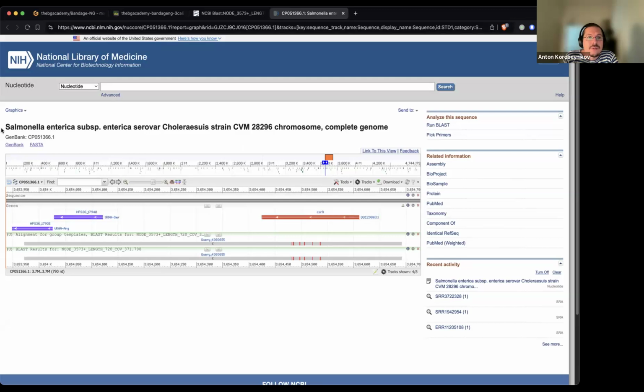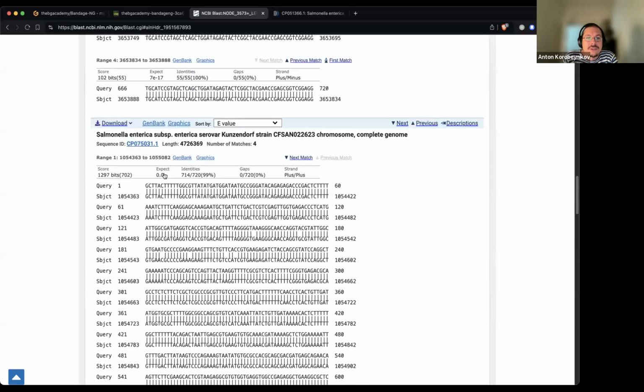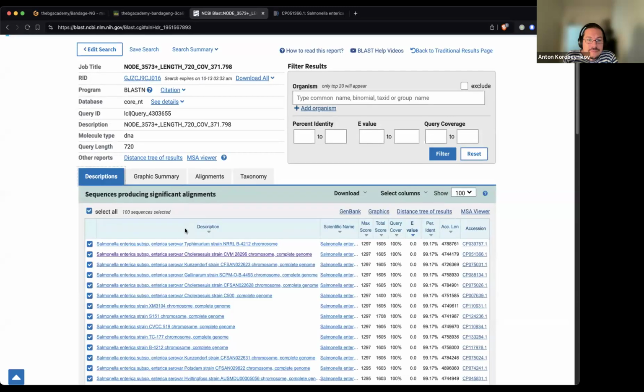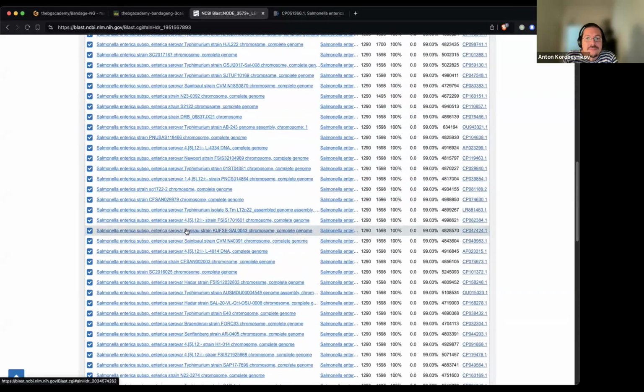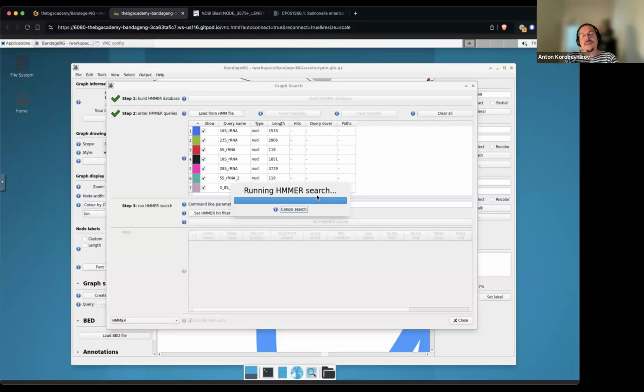We don't have the proper track here, sadly, for these hits, but it just happens. We're still waiting, but that's just because we are matching 70 megabases towards 7 different models.